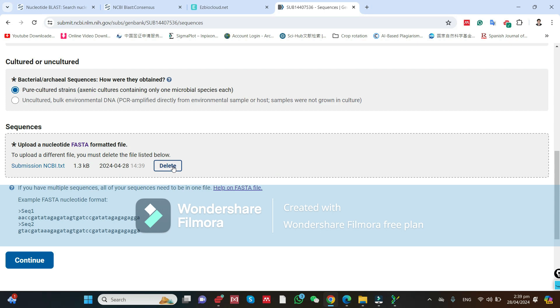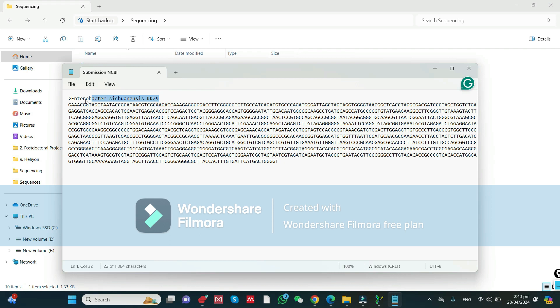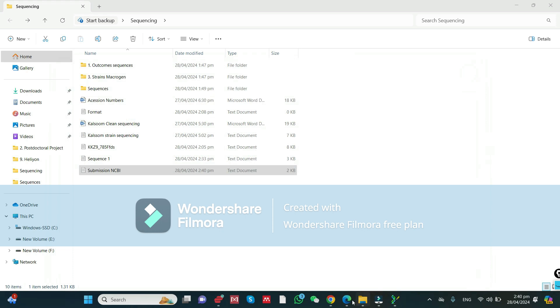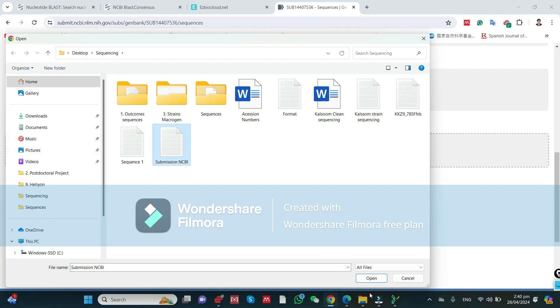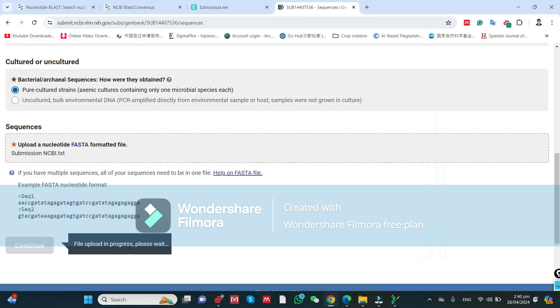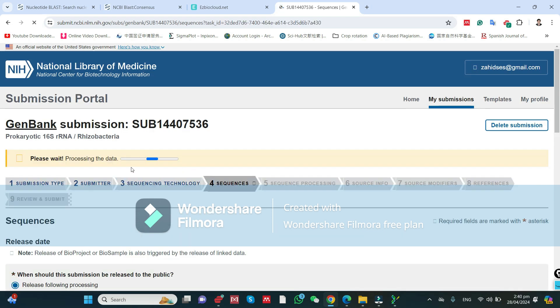Before uploading, note that NCBI will detect sequences by their sequence name. The file name must be formatted as 'sequence 1'. If you have more sequences you need to type sequence 1, sequence 2, sequence 3, and so on. Press Ctrl+S to save this file. Then again go to Choose File, navigate to the submission FASTA file, and select it.